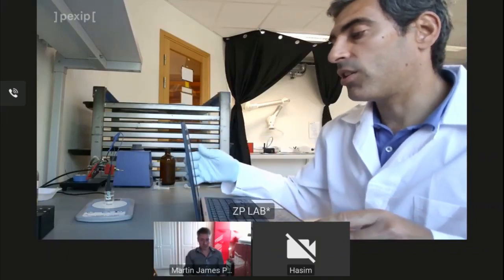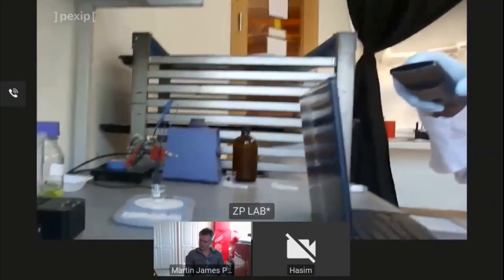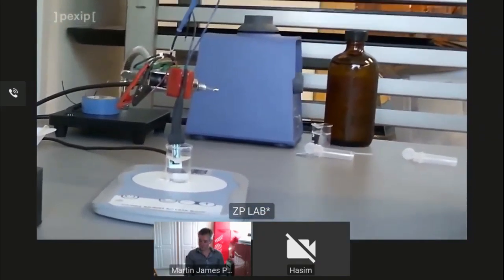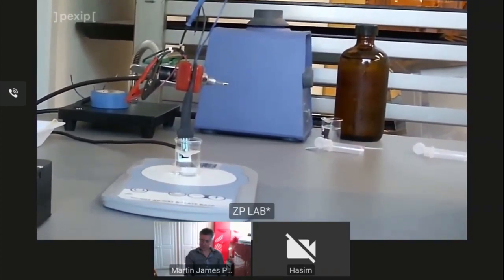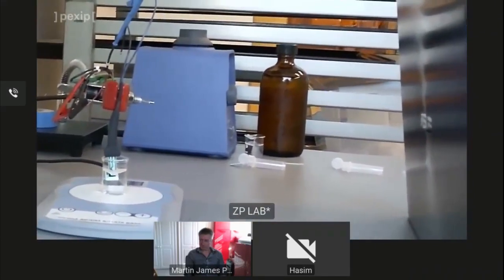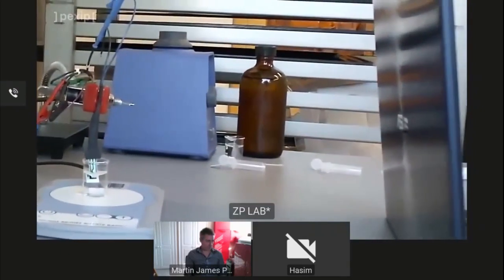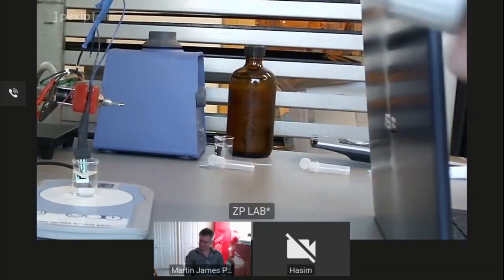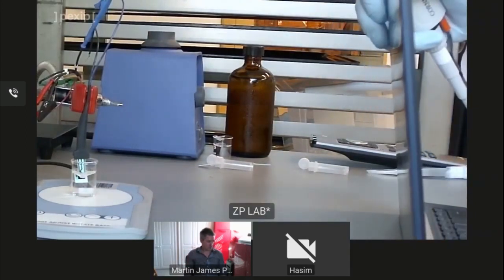and basically on this setup, I'm using a beaker. I have everything connected to the anapod, I use a connector, and I'm immersing the sensor in a 5 milliliter beaker containing a buffer, and I'm going to increment the sodium concentration with a ZP calibration solution. The reason for doing this is that I'm constantly supplying the electrodes with new ions, and you'll be able to see a very nice signal. So in order to do this, I have to pipette the calibration solution, titrating different concentrations of sodium.